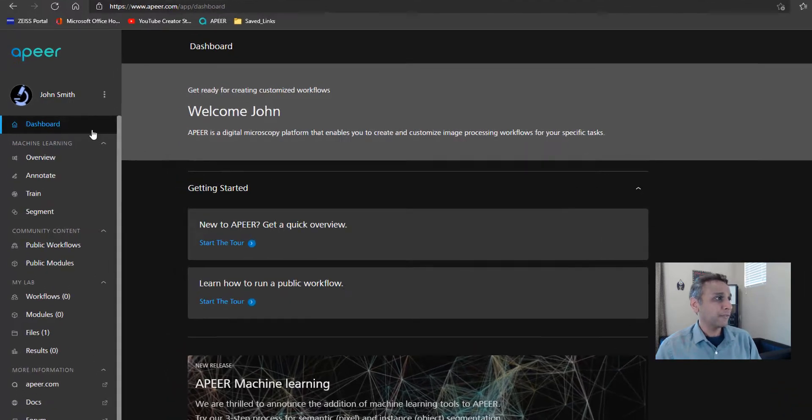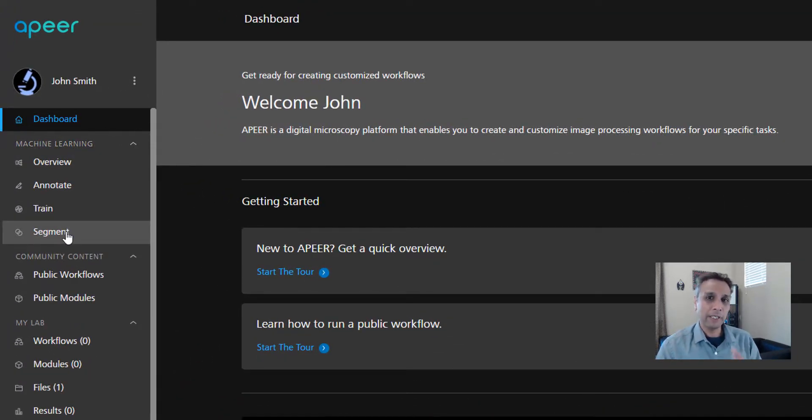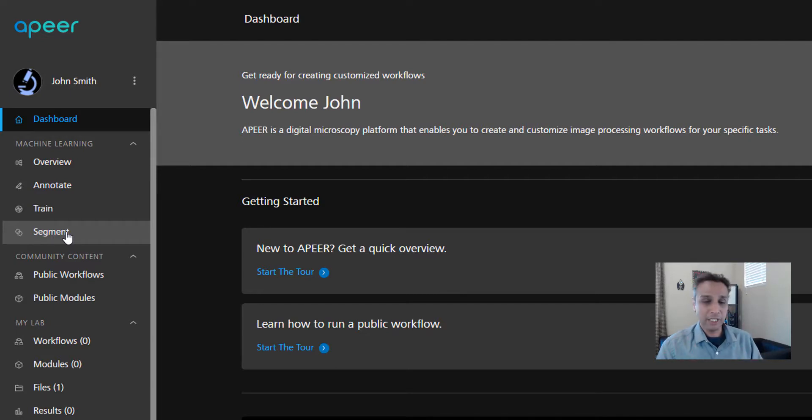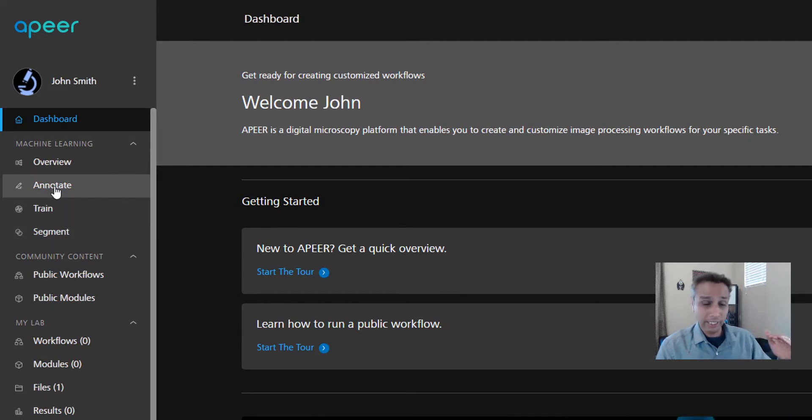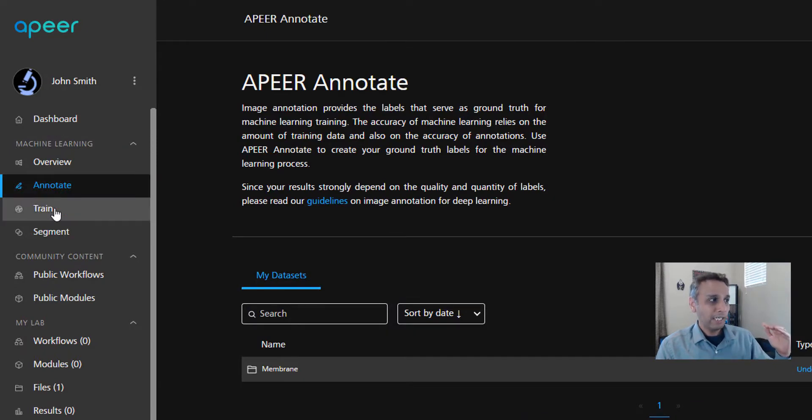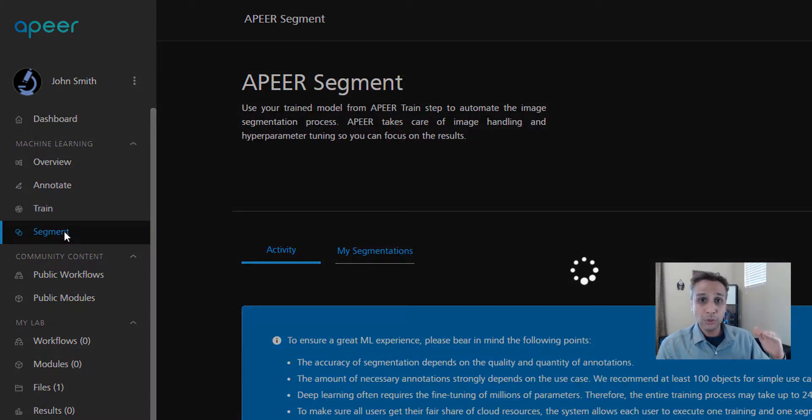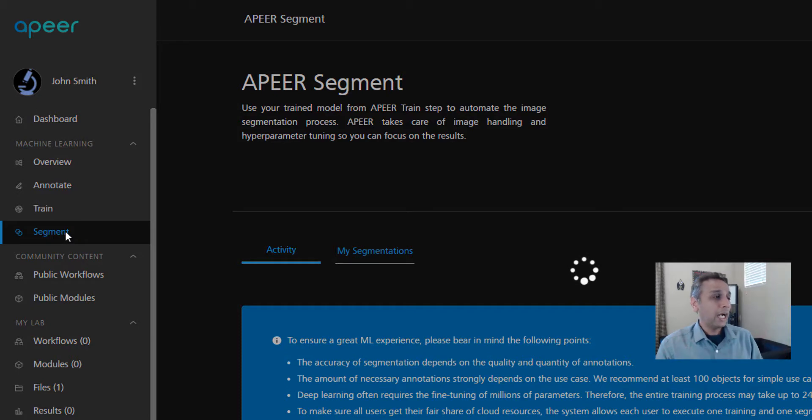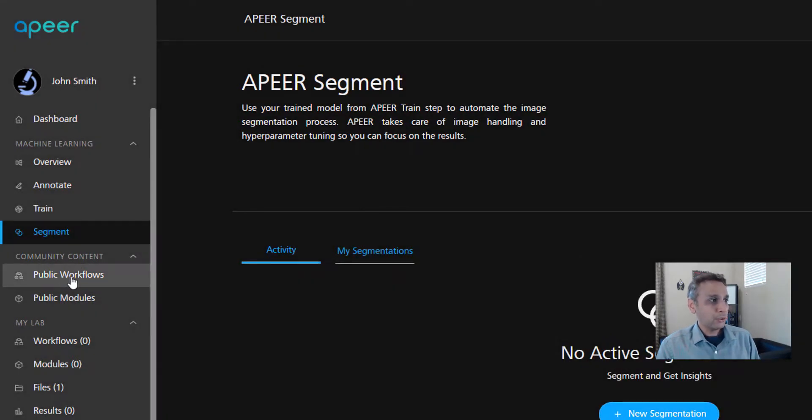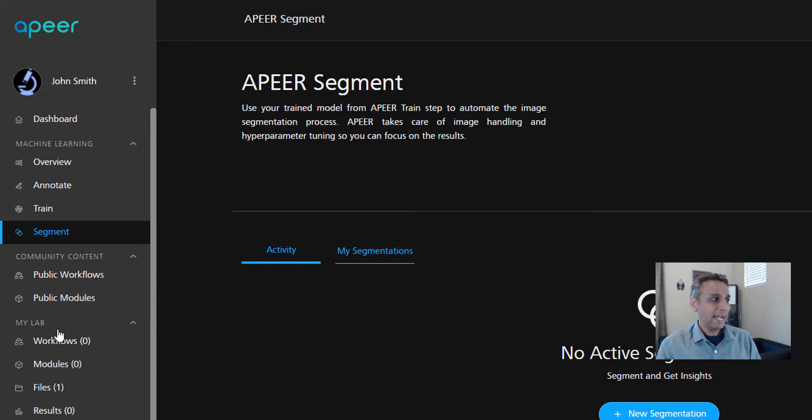First, start by signing up for your free account at www.apeer.com. If it's your first time, take some time to familiarize yourself with Apeer because there may be certain tools that are useful for you besides just the tracking. For example, if you look at the machine learning toolkit, it contains all the tools you need for deep learning based training and segmentation, including annotate.